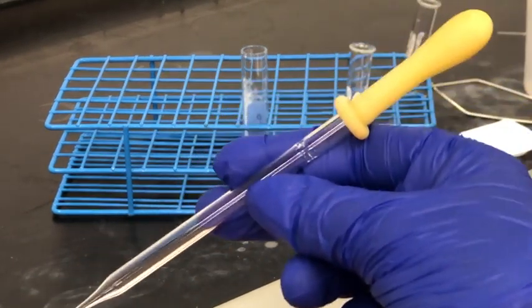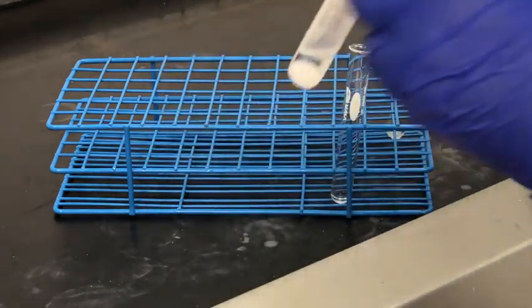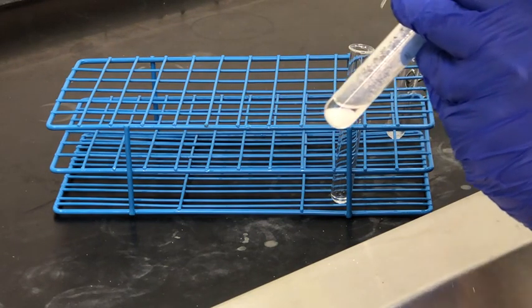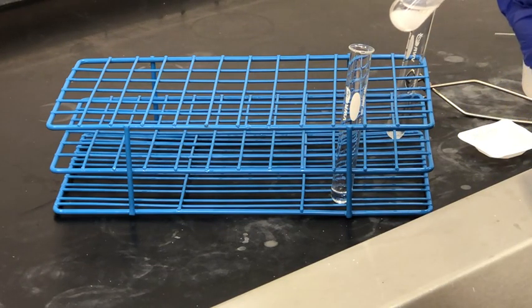Now we're going to use a fresh clean pipette to transfer any liquid from our centrifuge tube into a new test tube, using that same method as before — placing the pipette tip at the very bottom and drawing up liquid, then transferring it. Now let's look at our flow chart: what is the solid in the centrifuge tube and what is in the liquid that we're transferring to this new test tube?